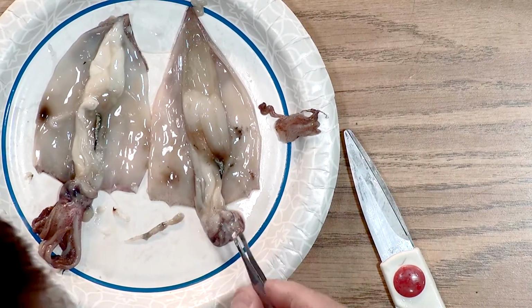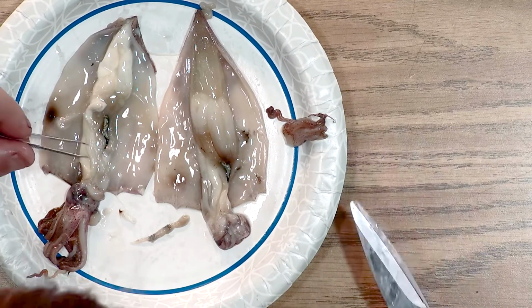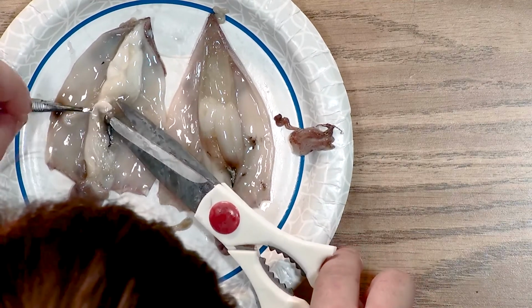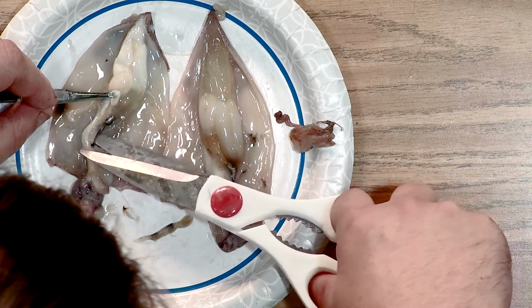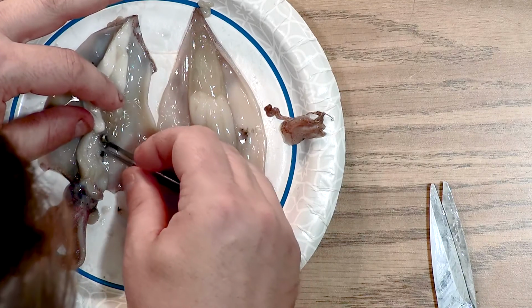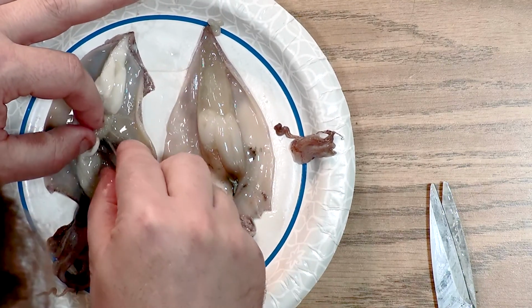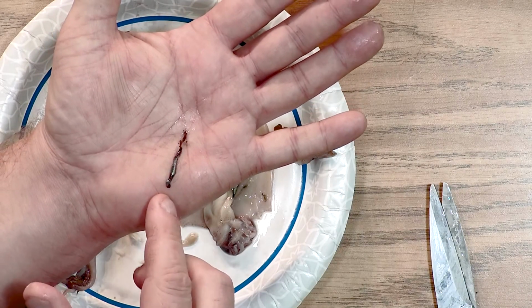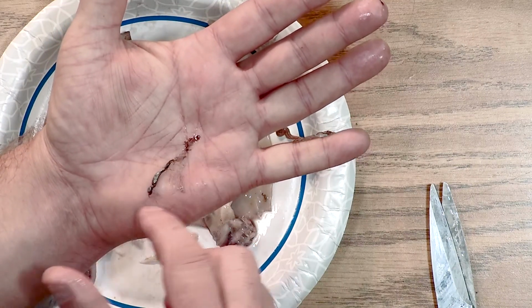All right, so we've kind of looked at that, and I wanted to show you something about these ink sacs that's pretty cool. Now, if I can get in here and separate this, okay, kind of cut it free. See if I can get it without rupturing it. Come on, buddy, it's almost there. Awesome. All right, so you can see I've got this ink sac in my hand now, and it's kind of like worm looking, and it's pretty long.